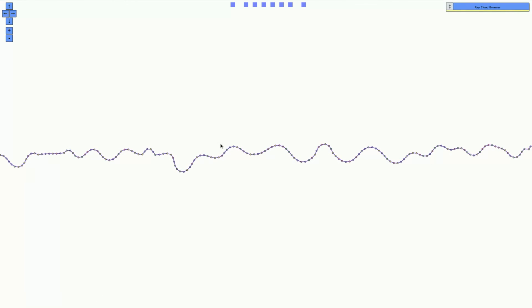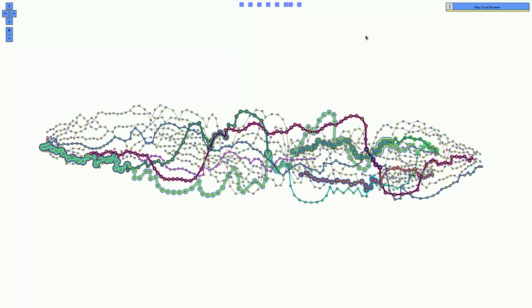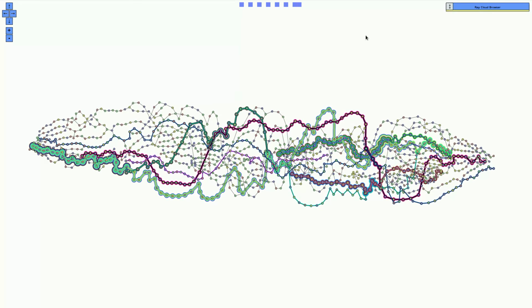Most of the paths are easy to find in the graph because a sizable part of this graph is just long linear stretches of DNA. Let me show you an example. As you can see, this is easy to go from here to there because there is just one way to do it. This completes what I wanted to share with you today.